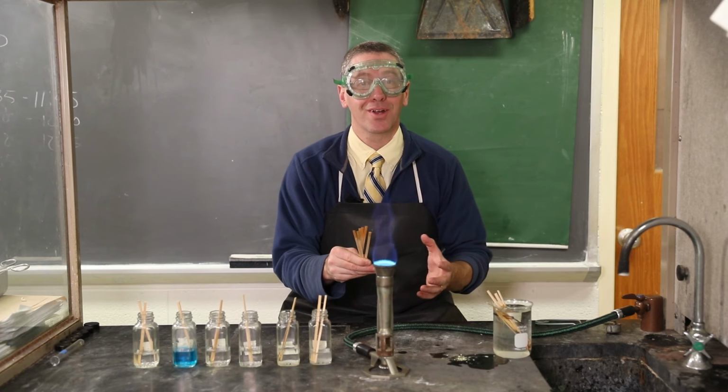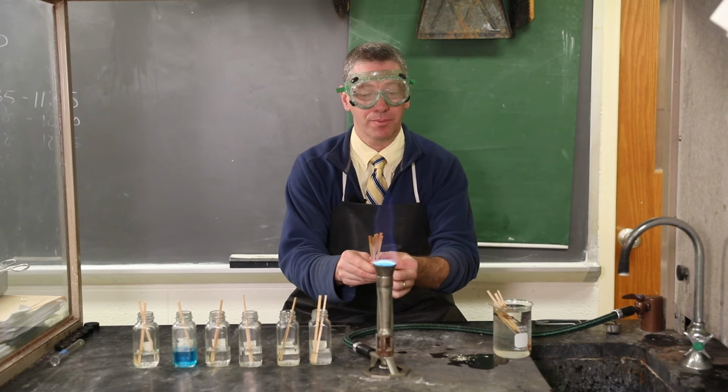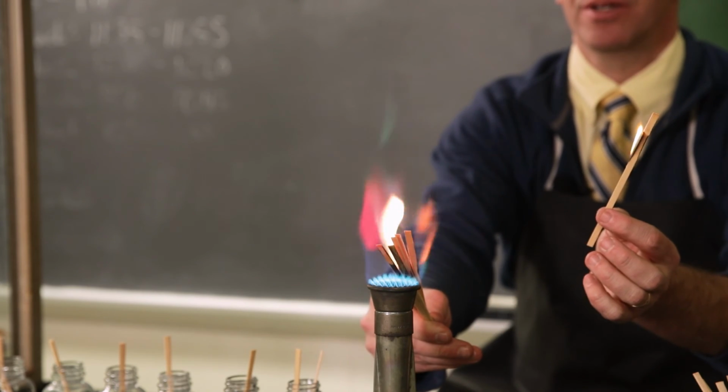So if you hold them just right, you can actually do all the colors at once. We'll do it with and without sodium because sometimes sodium overpowers the rest. Here we go. If I take sodium out, you can see the others.